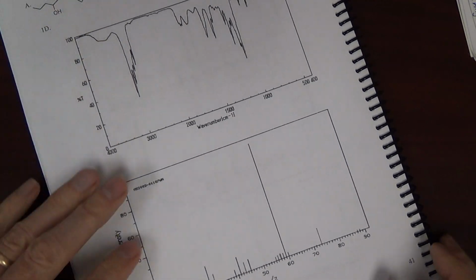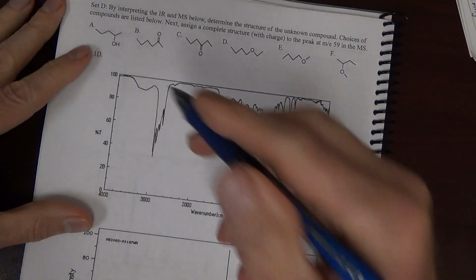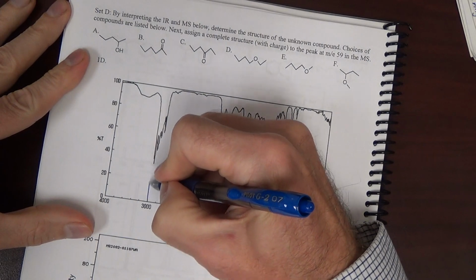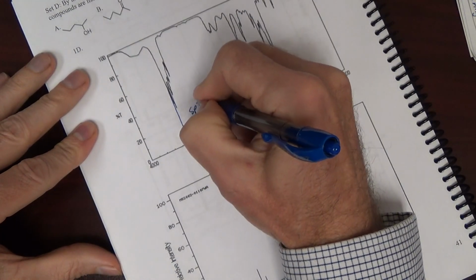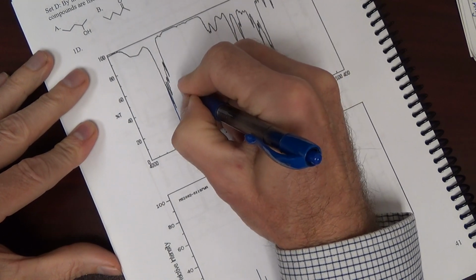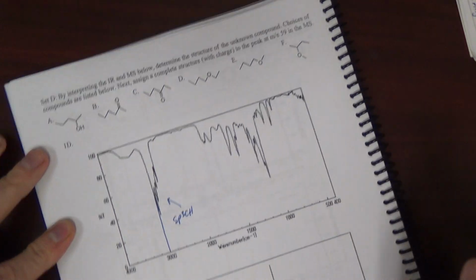Page 41. Actually, I'll go ahead and work one of these because there's another one, I believe, on page 42 for you to work. So I'll go ahead and look at this here. What do we have? 3,000? Remember the magical line of 3,000? We have sp3 C-H. I would hope so, because every one of those compounds has sp3 C-H.